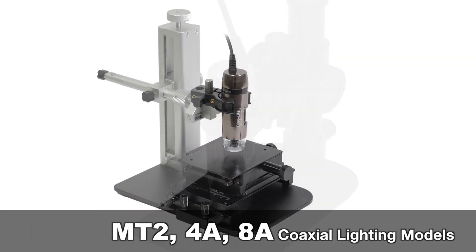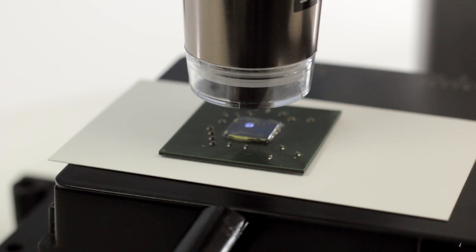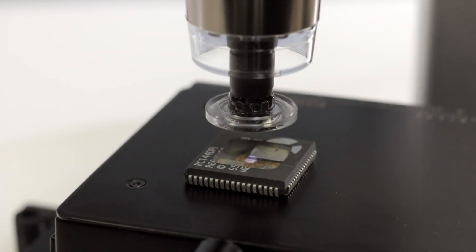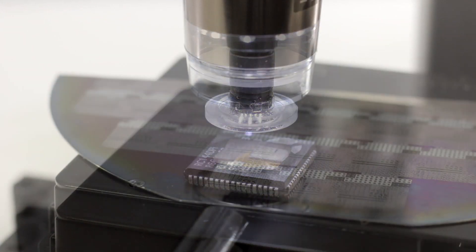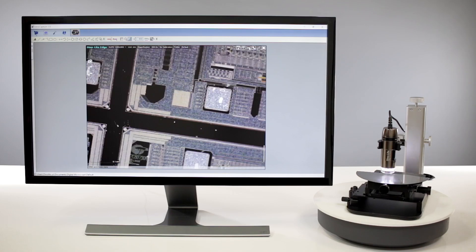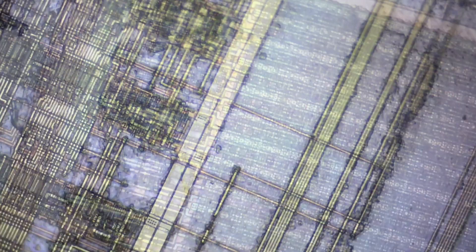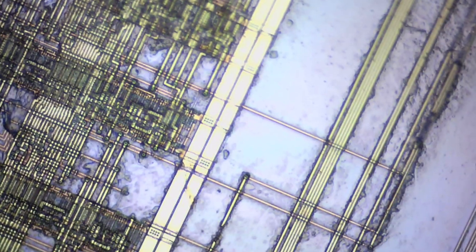Introducing the Dynolite coaxial lighting models AM7515MT2A, AM7515MT4A, and AM7515MT8A.